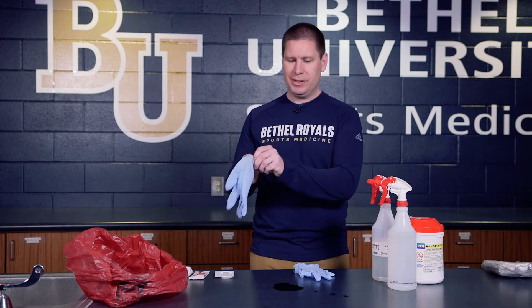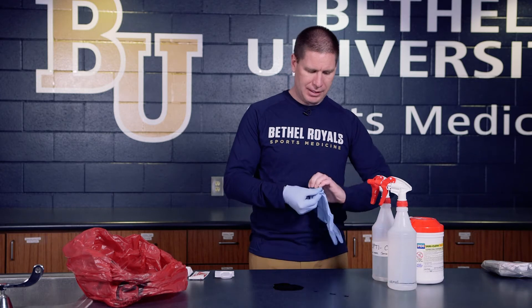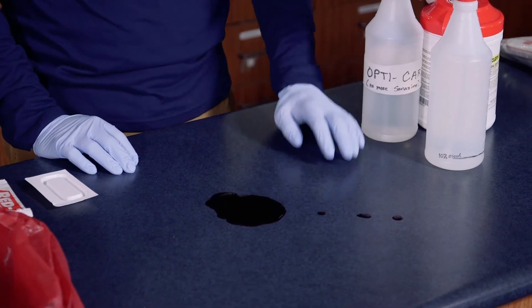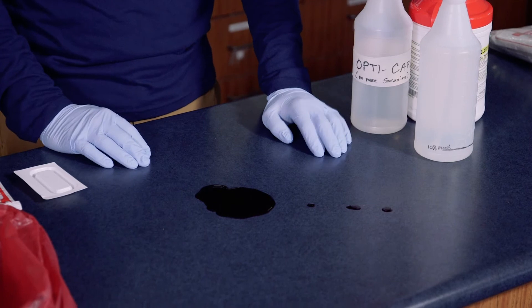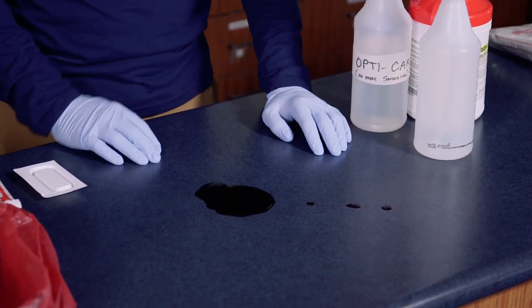First, because we're going to be using our hands, we're going to put on our gloves and make sure those are secured. Depending on the size of the spill, that helps decide how you want to clean the area up. If I just had three little blood droplets, that's not really a huge problem — I would just spray it, disinfect it, wipe it up with some gauze, and dispose of it in the appropriate biohazard container.